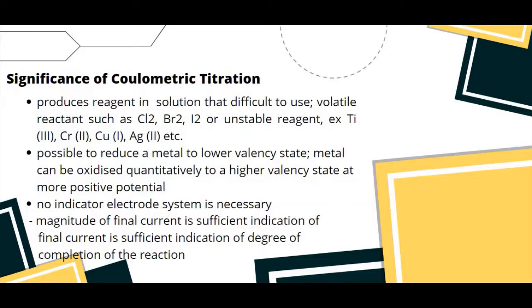No indicator electrode system is necessary in coulometric titration. The magnitude of the final current is sufficient indication of the degree of completion of the reaction.